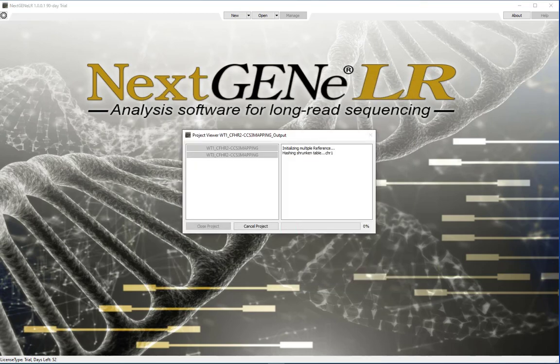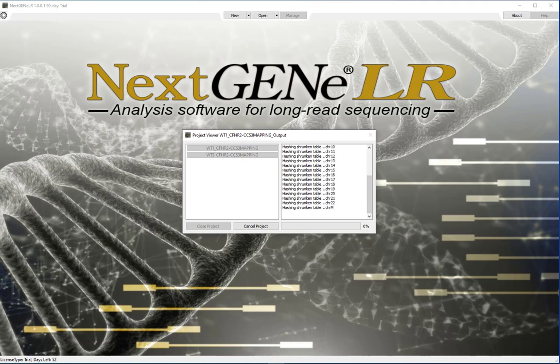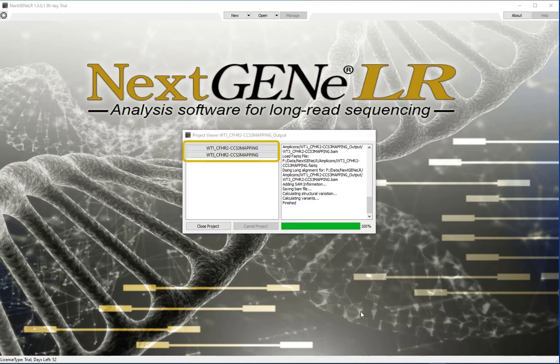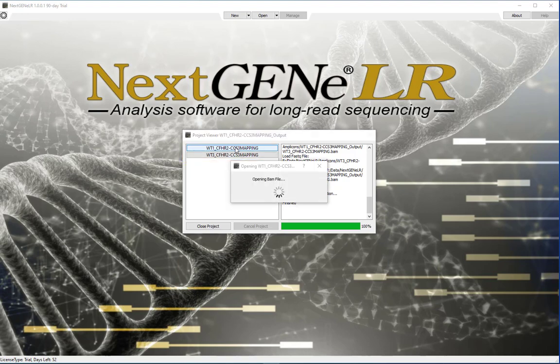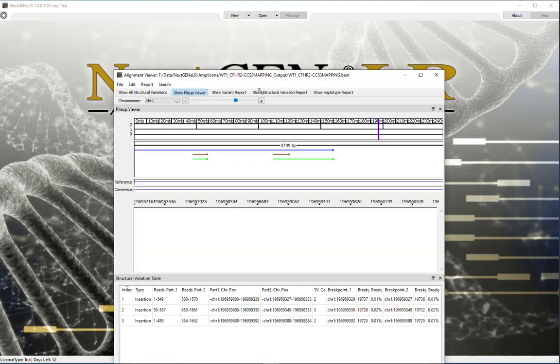As the samples are processed, the project viewer is updated to show the progress. When a sample is completed, on the left side, a button with the sample name becomes active. Once this happens, you can click on the button to load the sample's results in the viewer.